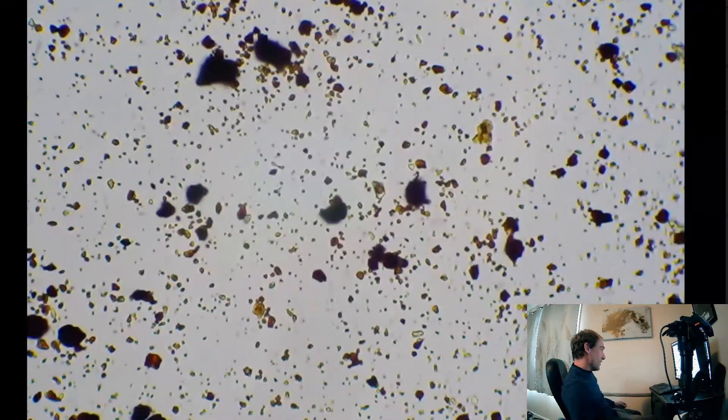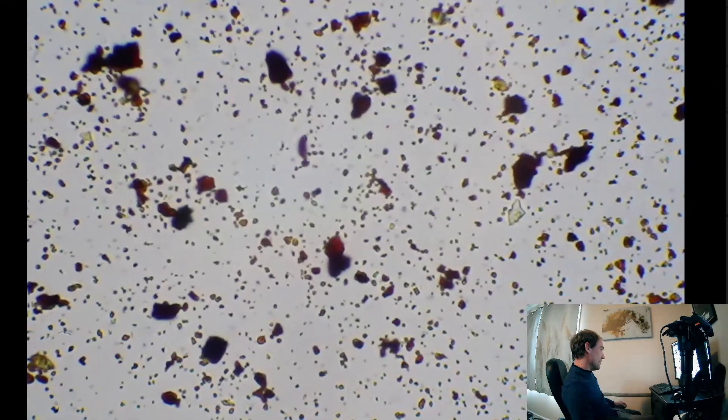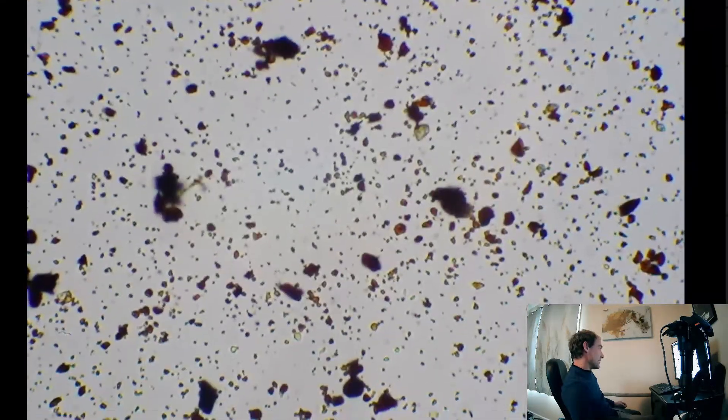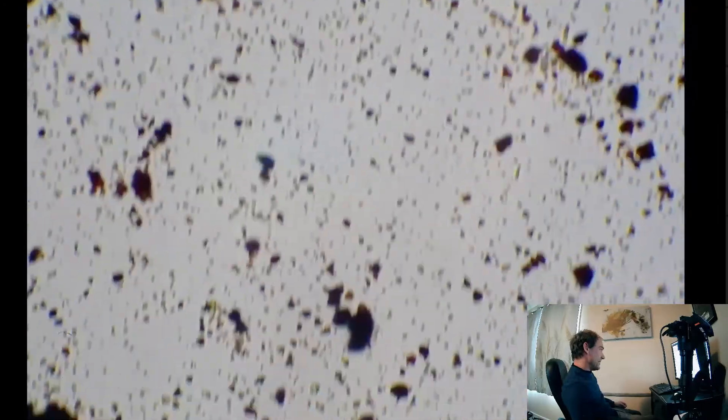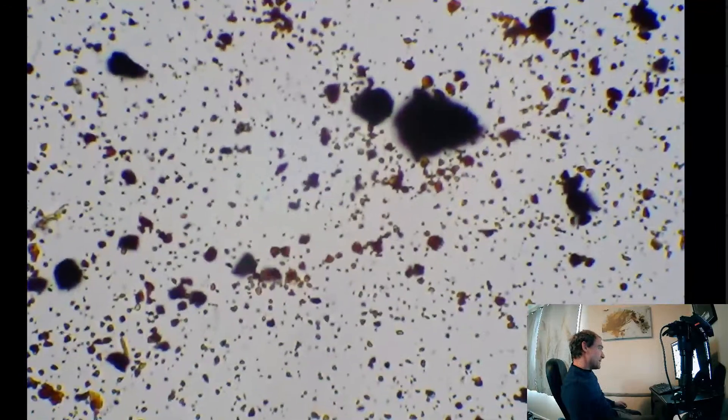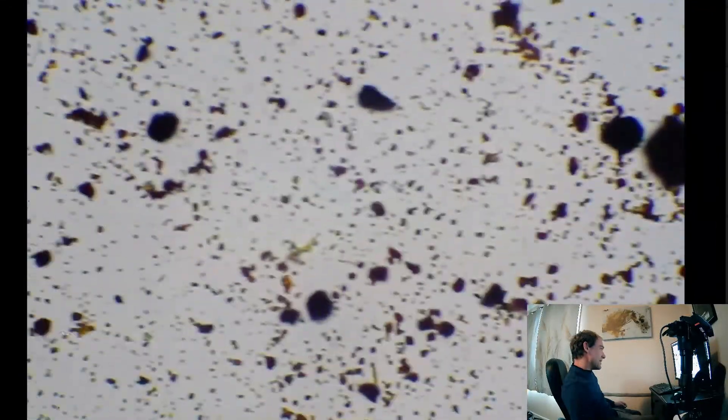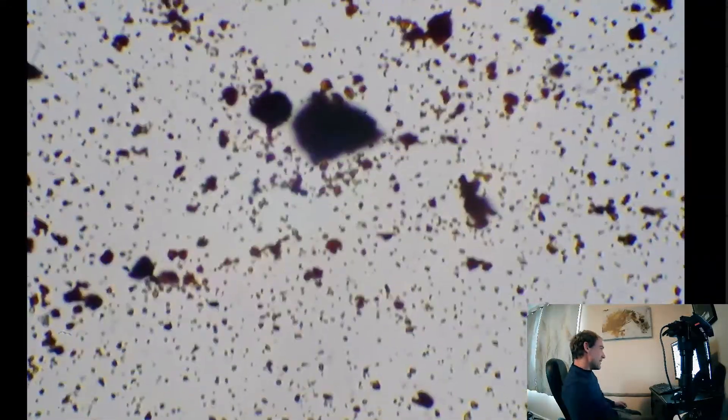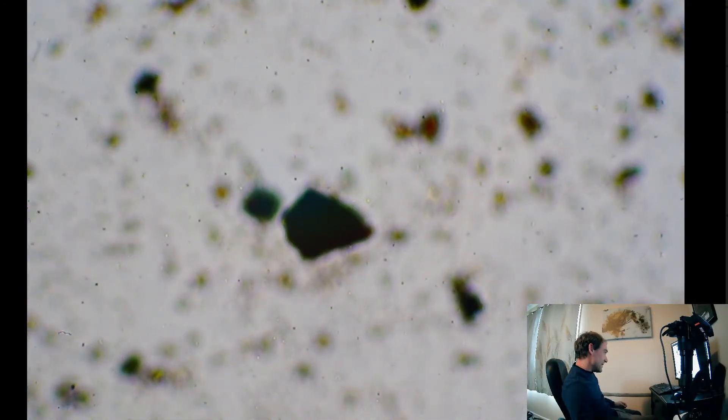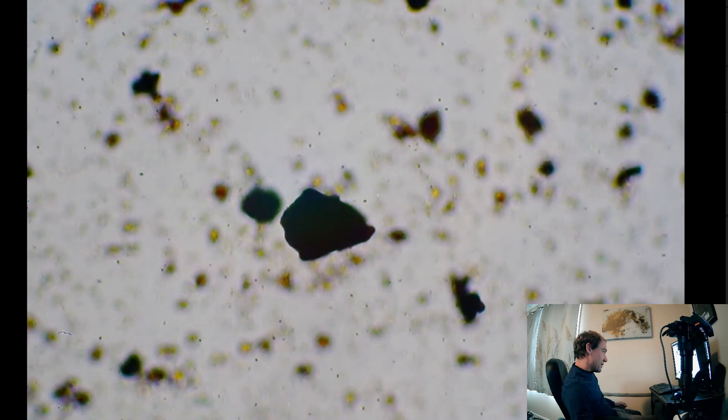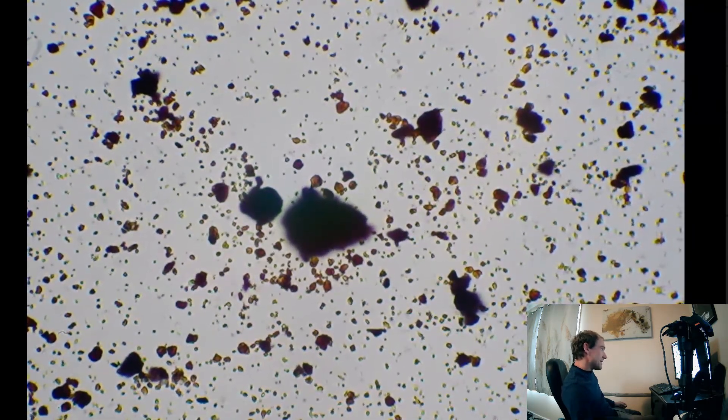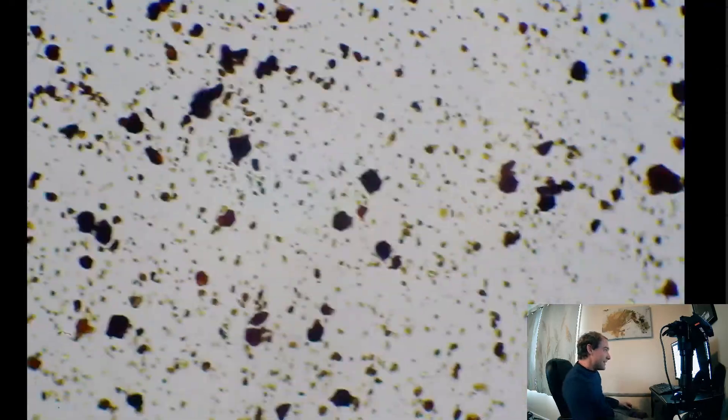Did we see something big moving over here? No, that was just the corner of my eye. All right, so do we see anything else besides bacteria and a whole bunch of these little aggregates in here? Yep, that's more bacteria wiggling in the top of the slide. Quite a bit of life.